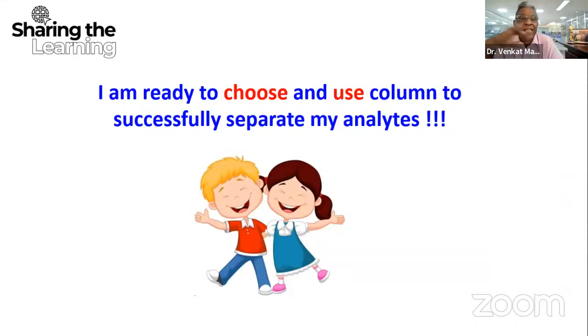We have a series: C18 column regeneration, C8 column regeneration, amino column, NH2 column, how to regenerate it, CN column, how to regenerate. These are separate procedures. We will share with the audience at that point in time. Probably you have to wait some 3 or 4 web seminars.